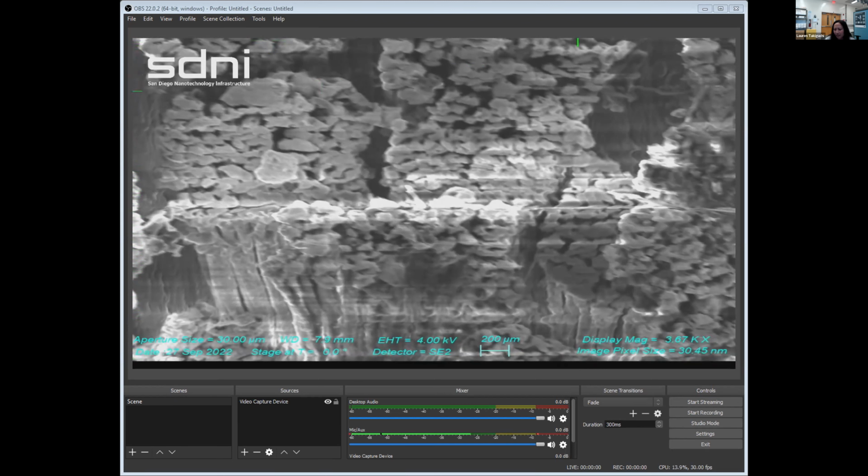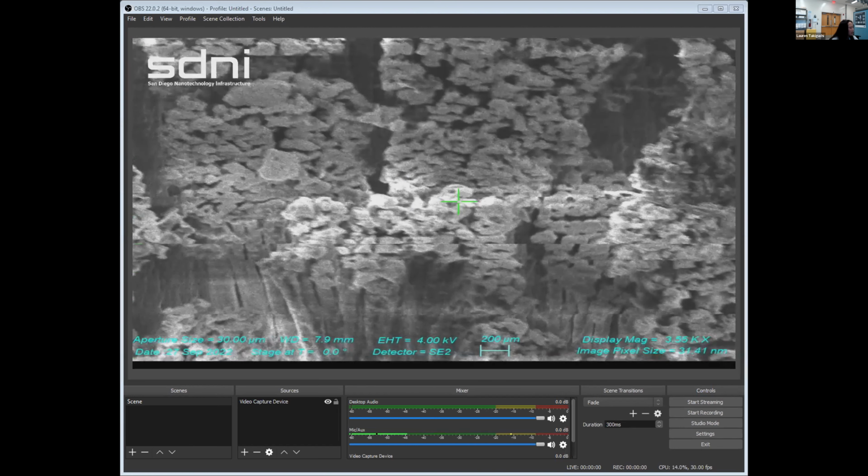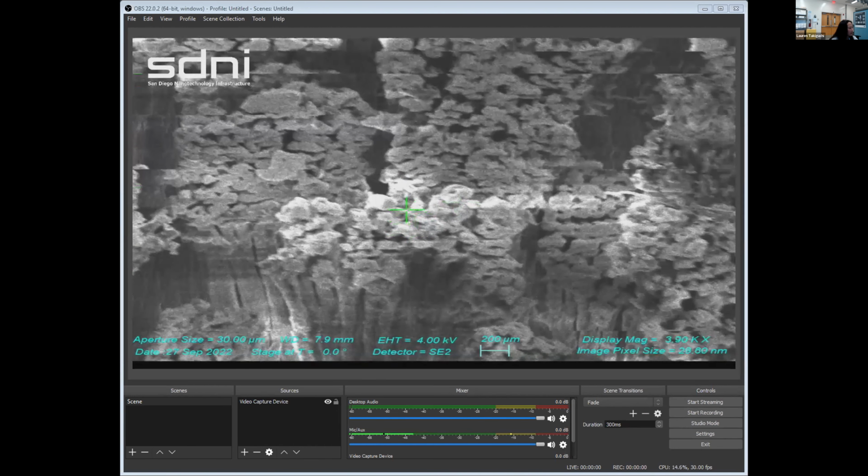But yeah, so that's a nanoscale view of how these nanostructures cause van der Waals attraction between the gecko and the surfaces, and that's how it adds up to enable the gecko to stick on ceilings or other surfaces. So yeah, we can try to go a little closer. Yeah, I was gonna say, proteins.